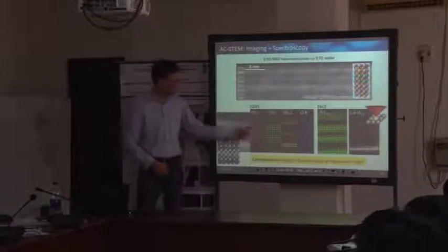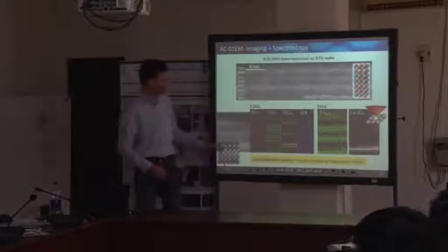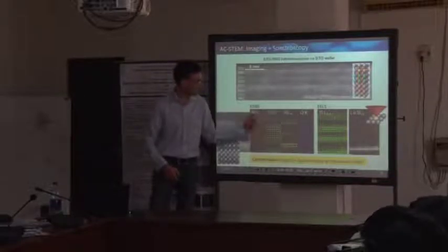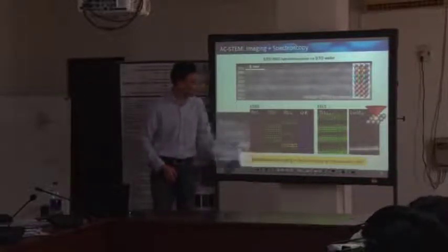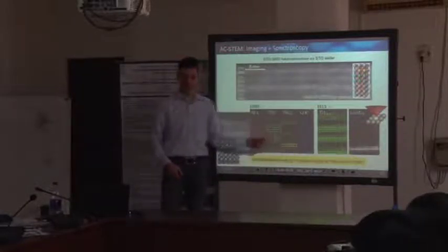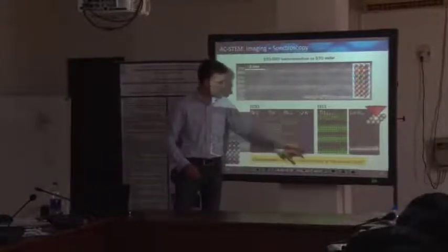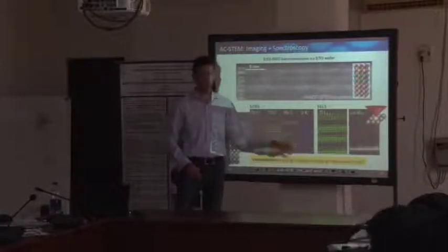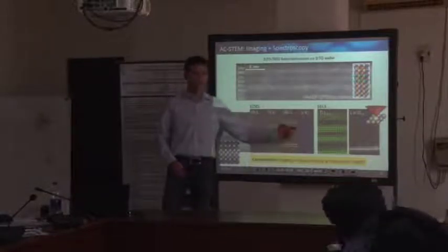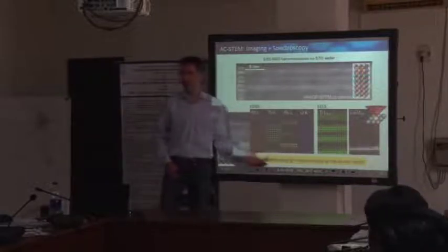This is EDS, where you can directly see this is the ruthenium, the 2 layers of ruthenium oxide, strontium ruthenium oxide. This is 1 unit cell of strontium ruthenium oxide embedded, and there is 1 layer of lanthanum down here. So the lanthanum, we didn't get that in the EDS, but don't ask me why. Unfortunately, what you hardly get is a clear distribution of the oxygen signal by EDS, simply because the detector efficiency for the low energy X-rays is low, as we learned, and this is just almost noise.